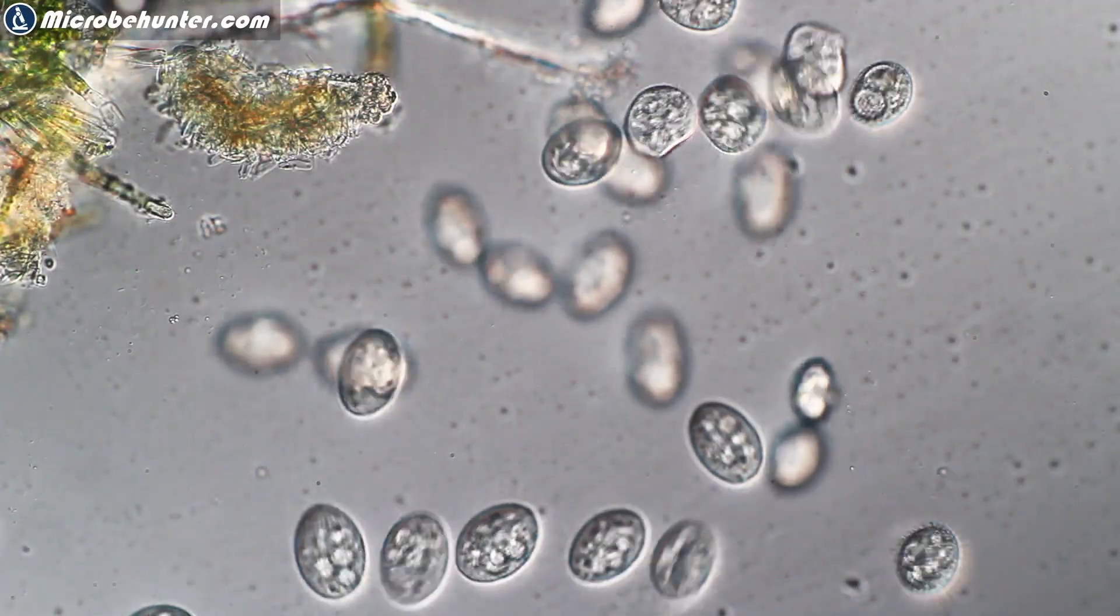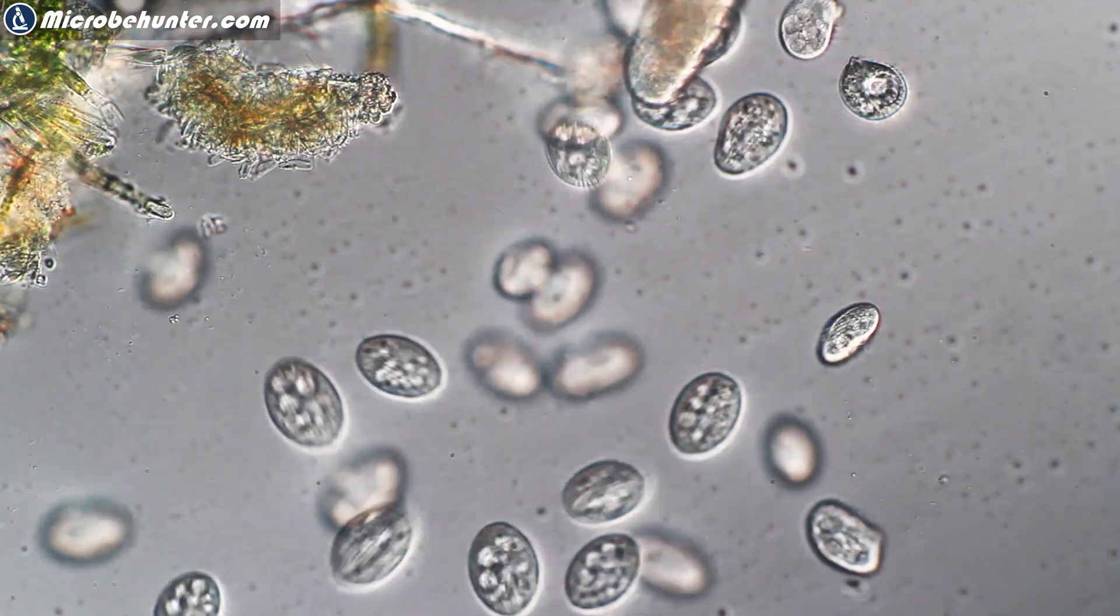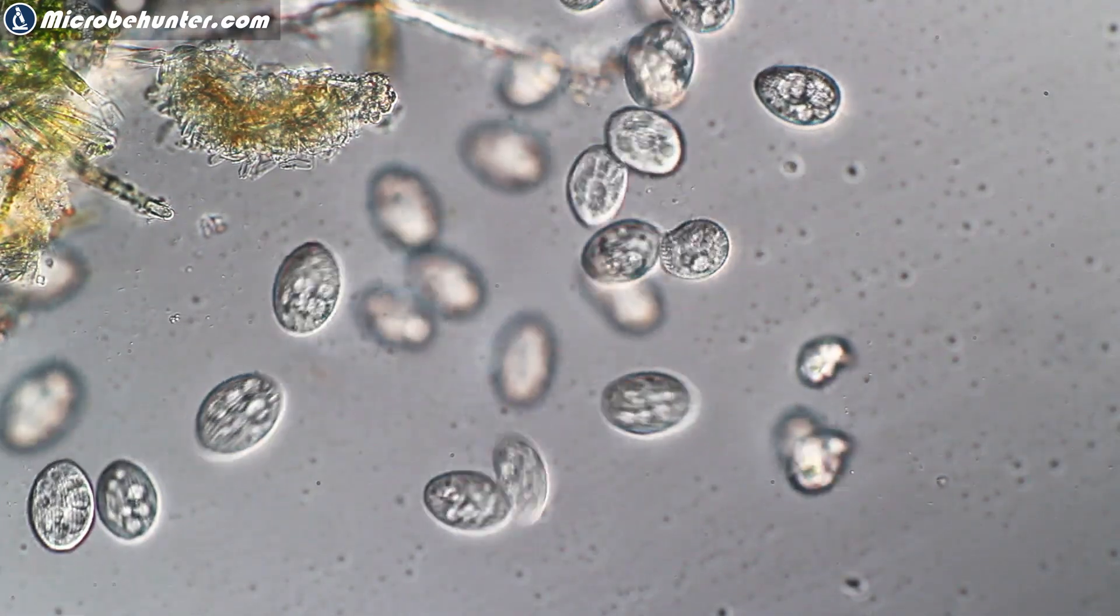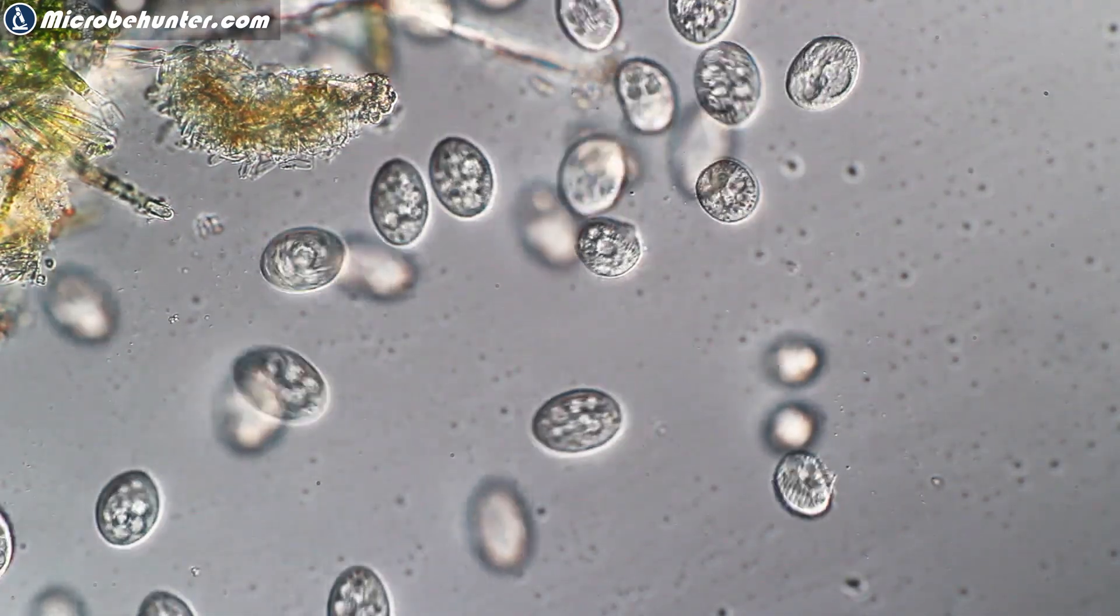Now if the specimen is moving, like fast moving protozoa for example, then by all means take a video. Photographs can be a disadvantage here. There are several reasons for this.